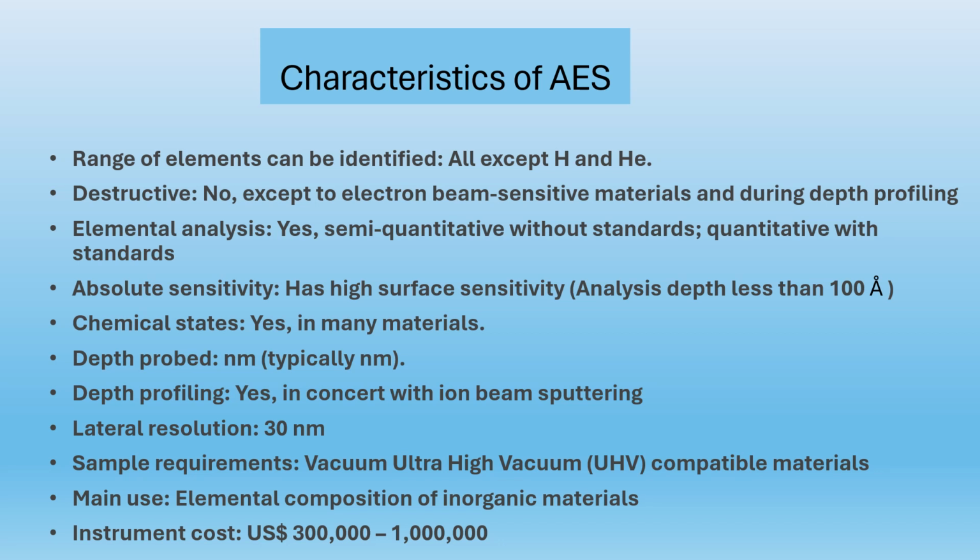So we have seen a very good example of how AES spectra can be used for depth profiling of a semiconductor or a ferroelectric material, that was a silicon substrate coated with different layers.